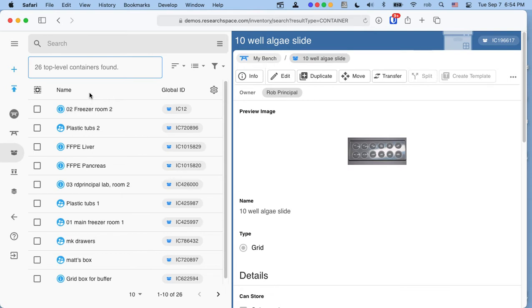Now, a good best practice when you're working with inventory is to start out by building your largest top-level containers that represent major storage areas in your particular lab. So this might mean your lab itself, particular research rooms, freezers, cupboards, storage areas. Top-level containers are a good way to start building the system, because then each individual user can then make the smaller containers inside the existing top-level containers that maybe you or one of the lab admins have built.